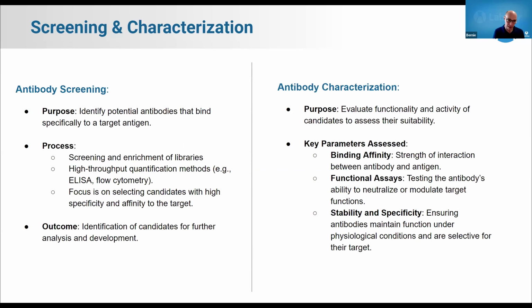That screening side, the most common purpose for doing that screening is to go from a huge number of possible sequences of potential antibodies down to many fewer that specifically bind to some target antigen, and also that don't bind too heavily to similar antigens.